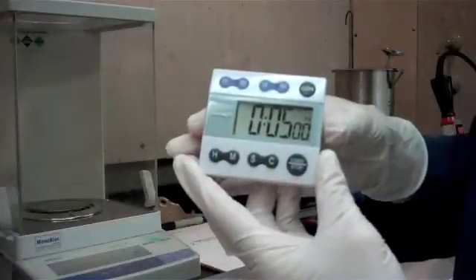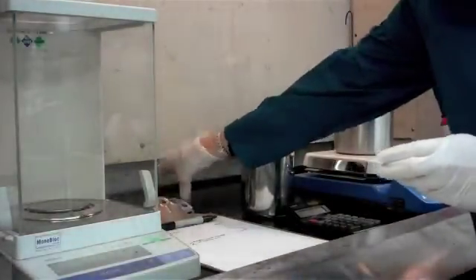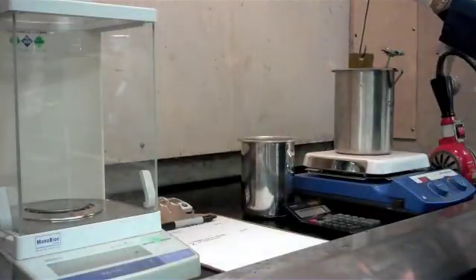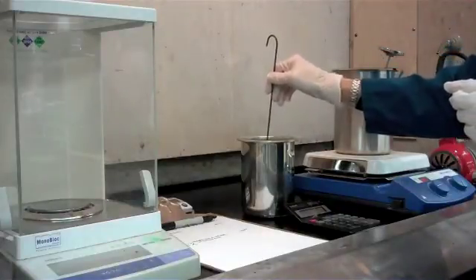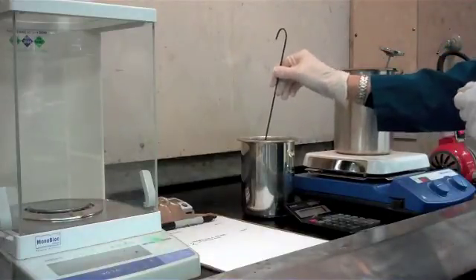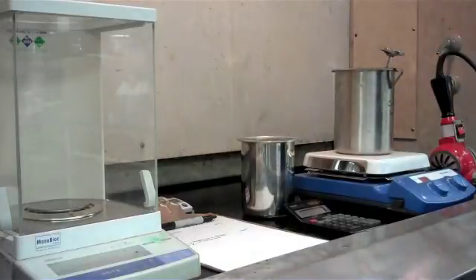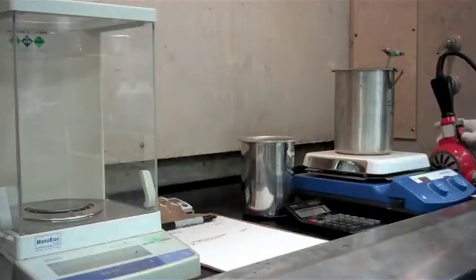Now that our 5 minutes has passed, we're going to take our panel out of our chromic acid solution and we're going to rinse it in water to get all the chrome residue off. Then we're going to dry it — I like to use my industrial strength blow dryer — and we're going to dry this up and let it cool.